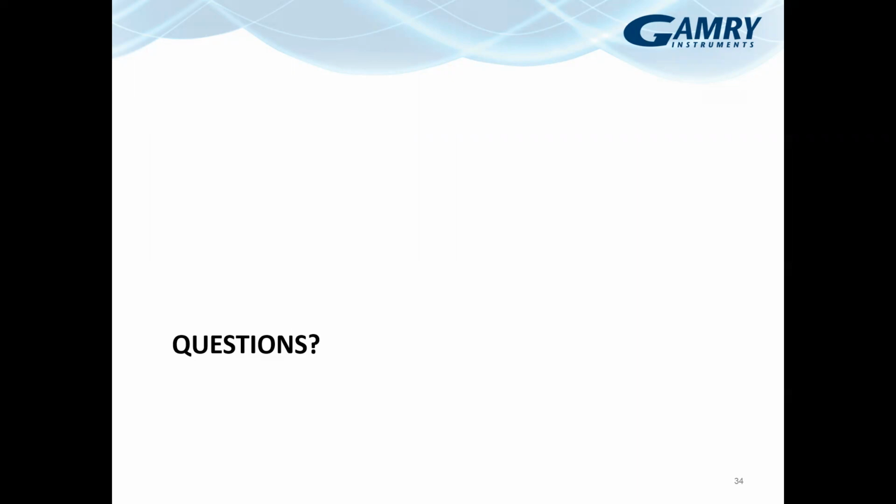And this is what I've seen with thick biofilm. You can put single cells down onto the QCM and fairly easily measure them. But as the layers grow and grow and grow, it's really difficult, actually impossible, to measure cells that are a certain thickness away from the crystal surface. So it's complex. Okay.